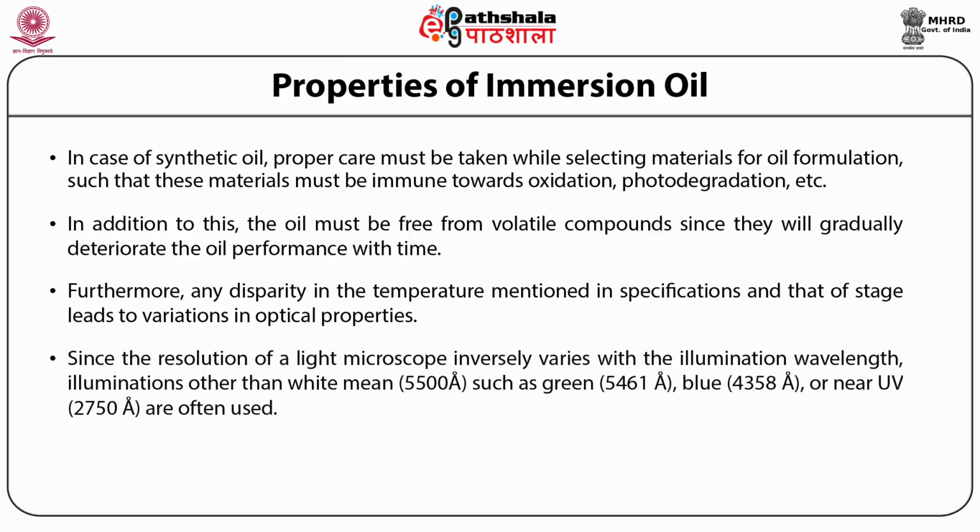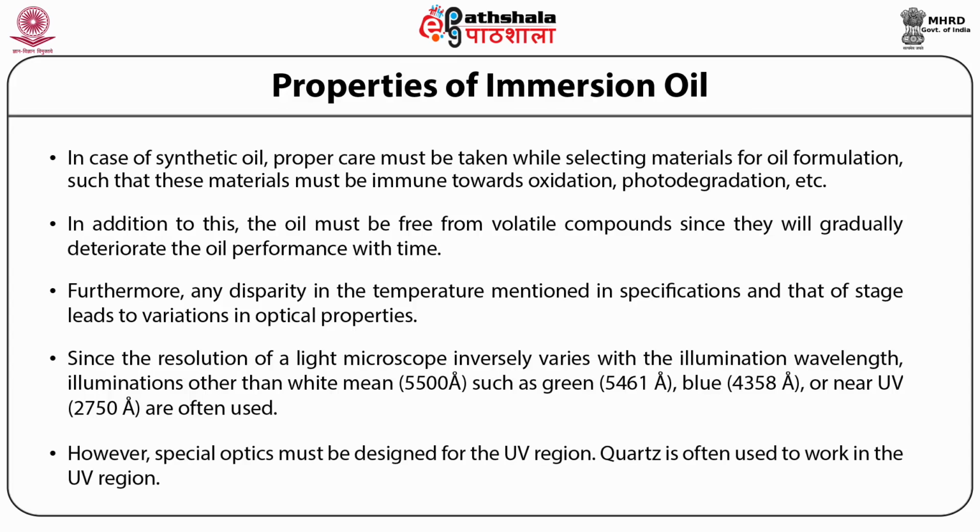Since the resolution of a light microscope inversely varies with the illumination wavelength, illuminations other than white light, that is 5500 angstrom, such as green, which is 5461 angstrom, blue, which is 4358 angstrom, or near UV, which is 2750 angstrom, are often used. The resolution is expected to increase further in the UV region. However, special optics must be designed for the UV region.